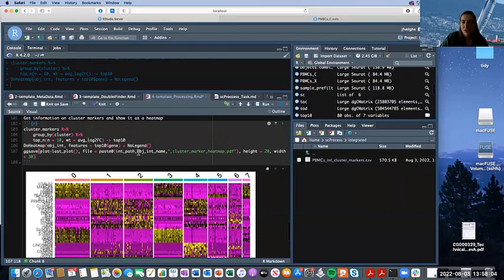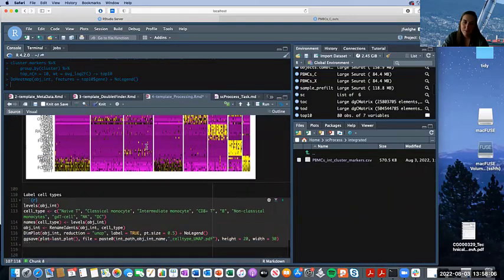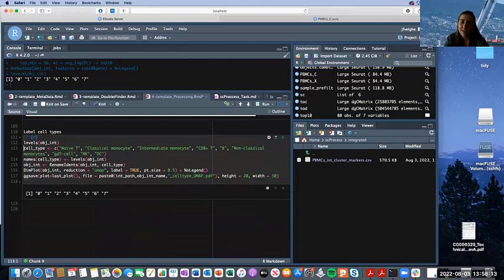So that's another way that you can generate a plot and a tool to label the cell types. And then lastly, you can look at the different levels you have, and this is going to pop up and show the numbers that represent the cell types. So if you want to label your cells, let's say you went through and you know cluster 0 is this type, cluster 4 is this type. Once you know that, you can label your cell type by just listing out the names that you want to call them, in the same order that you have for these values. And that'll stash the identities.